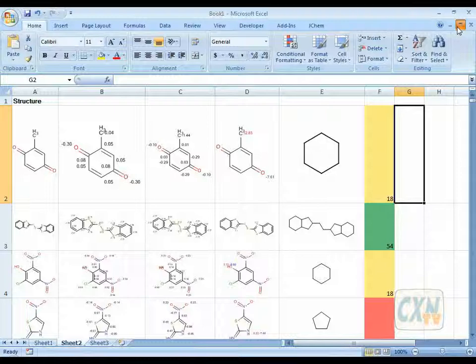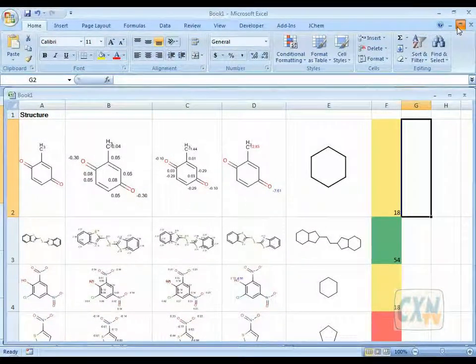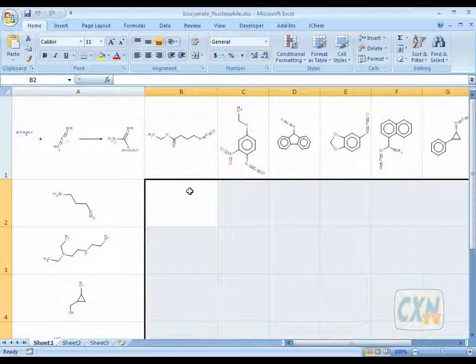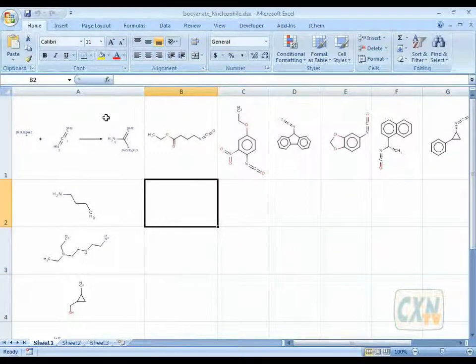And finally, let me show you one more interesting thing. Basically, it's a reactor functionality inside JChem for Excel. Hope it works as well. It was almost ready. So what you can see here is the reaction template, and on the two sides you can see the different reactants in a matrix format.